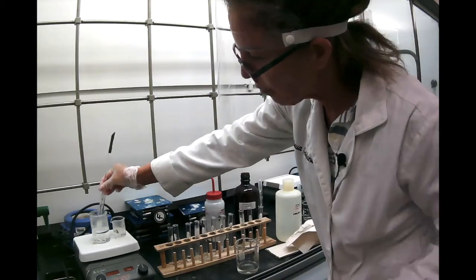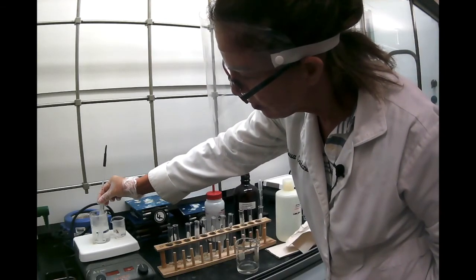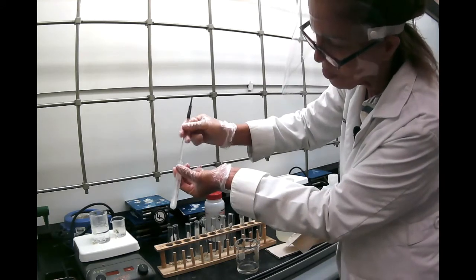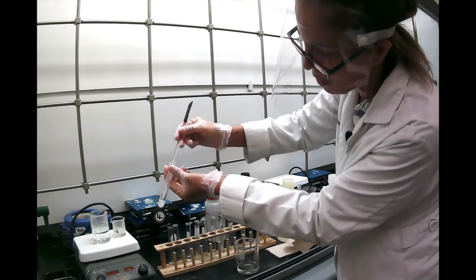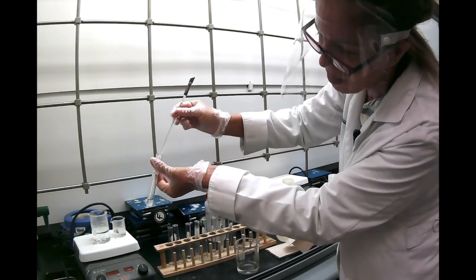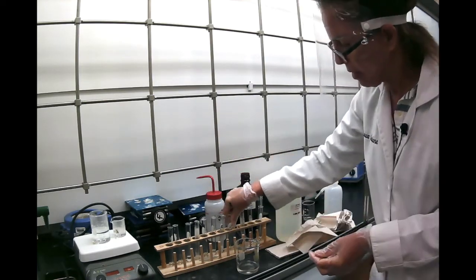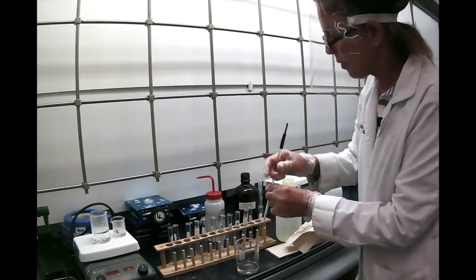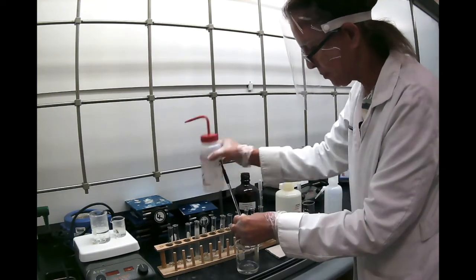So we're going to heat it for a few seconds. And you see it shoots out very quickly. That's the reason you have to be careful when you work with petroleum ether. It has a very low boiling point. And again, it's not dissolving. So benzoic acid is not soluble in petroleum ether, both cold and hot.